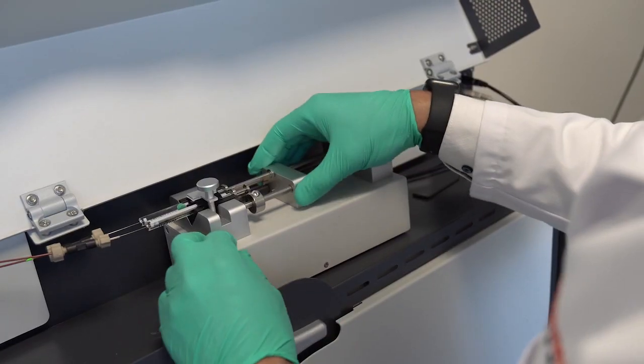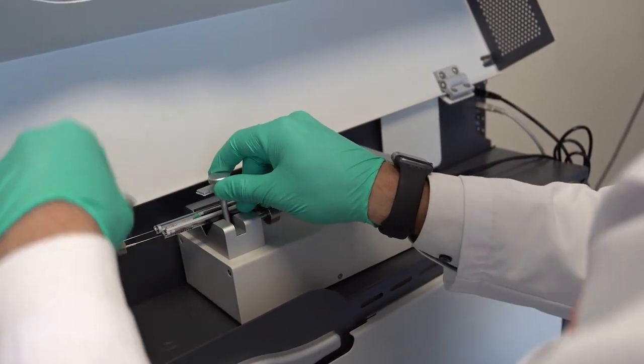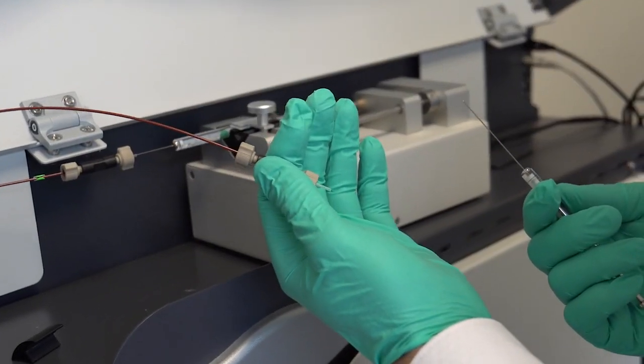I've been joining the Thermo Fisher Scientific team on developing the Orbitrap Explorers Isotope Solutions. More specifically, I've helped developing the methodology to analyze nitrate isotope ratios and natural abundances from liquid samples.